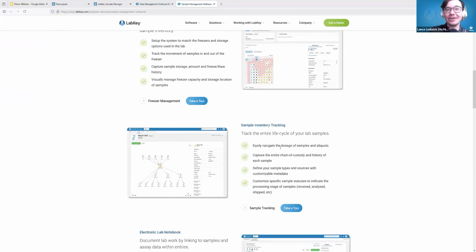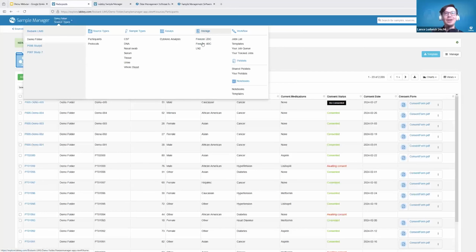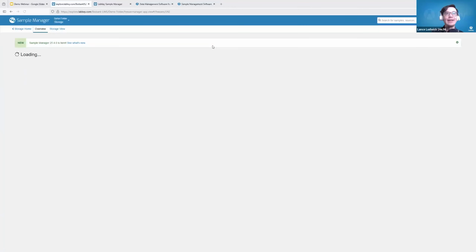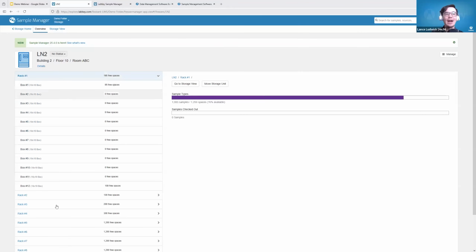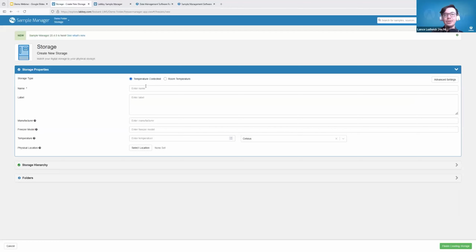How easy is it to configure different freezer layouts, particularly LN2 vessels? That is a great question. So all of these freezers, we can just do a very basic one, all have different layouts. So we can have as many different racks with boxes inside of them. These are all really what I tell it to do. So we can just create a freezer really quickly.